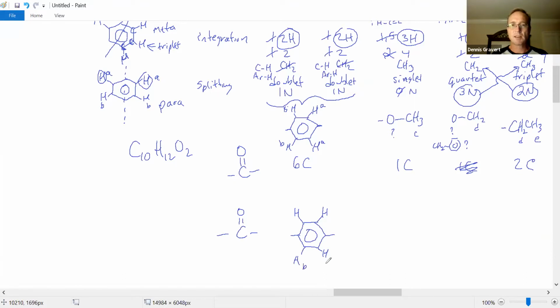This is B, and that's A. And then I kind of like this idea of the methyl on an oxygen, kind of an ether-like group. This is peak C. And then D is attached together, the E. I'm thinking maybe attach it to something. I don't know.